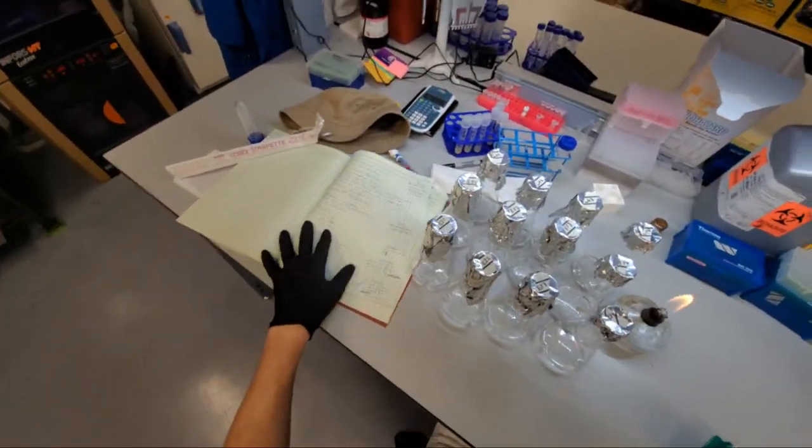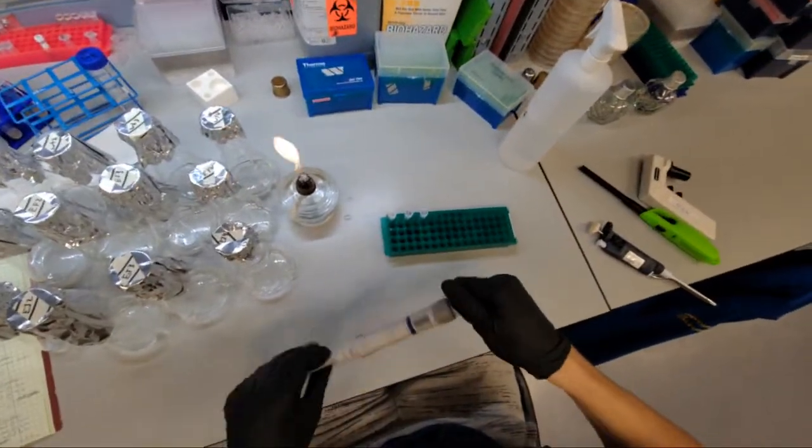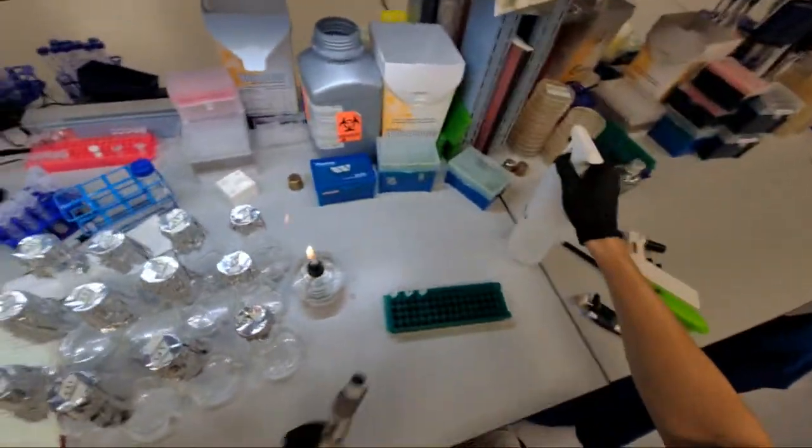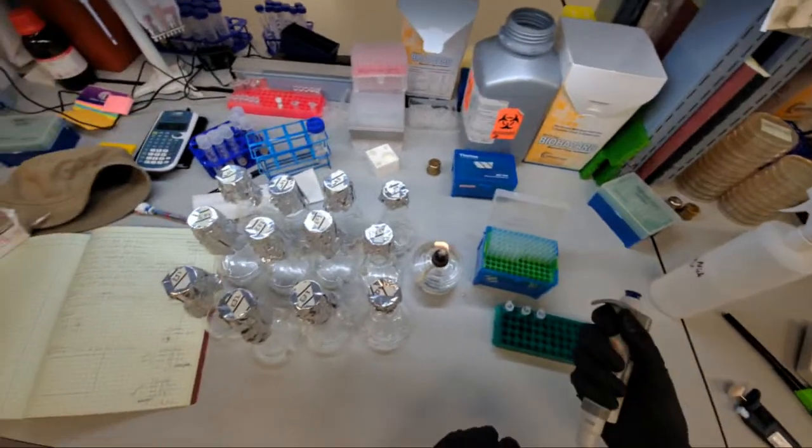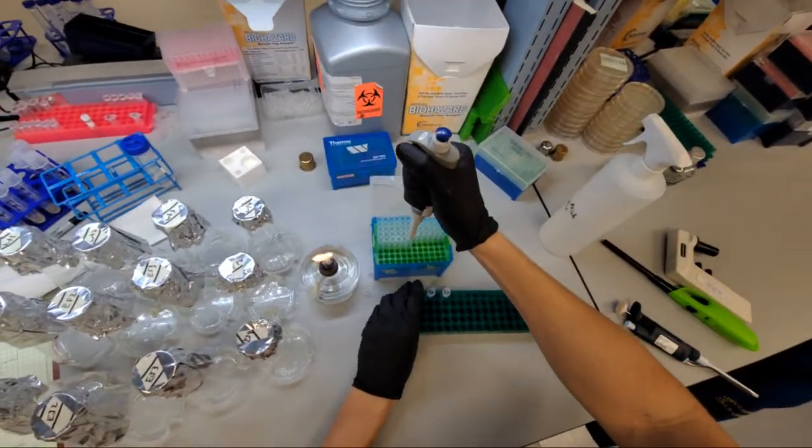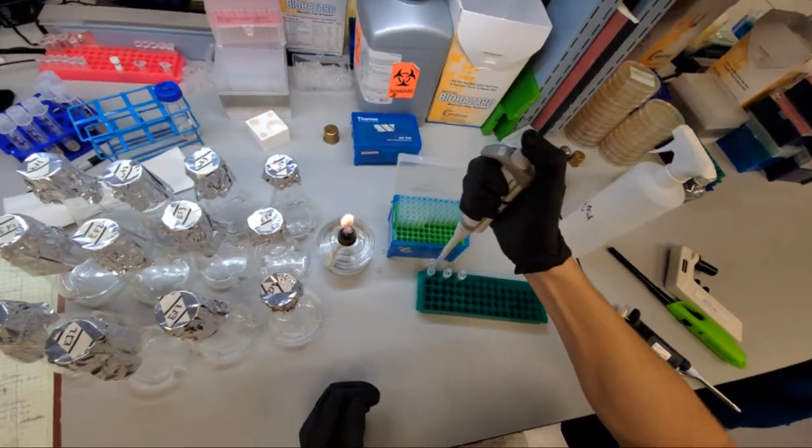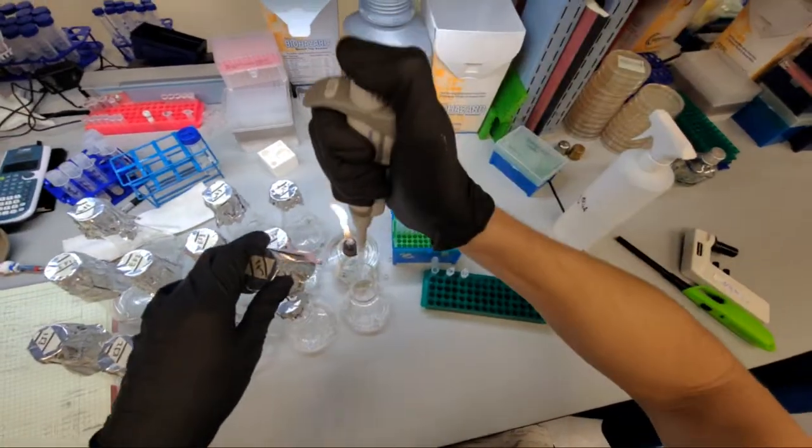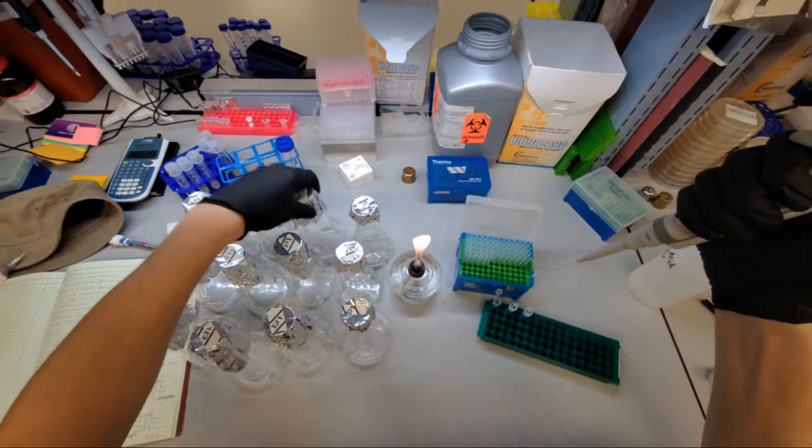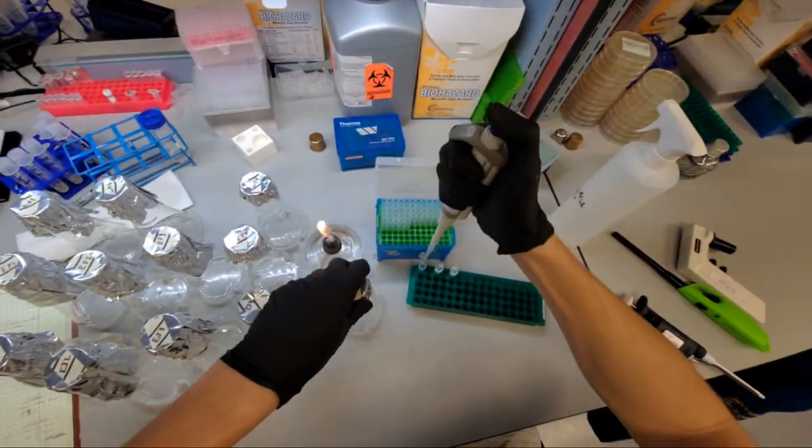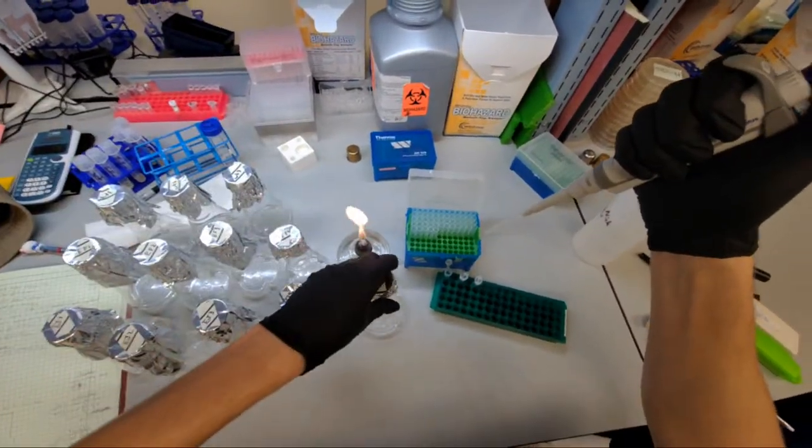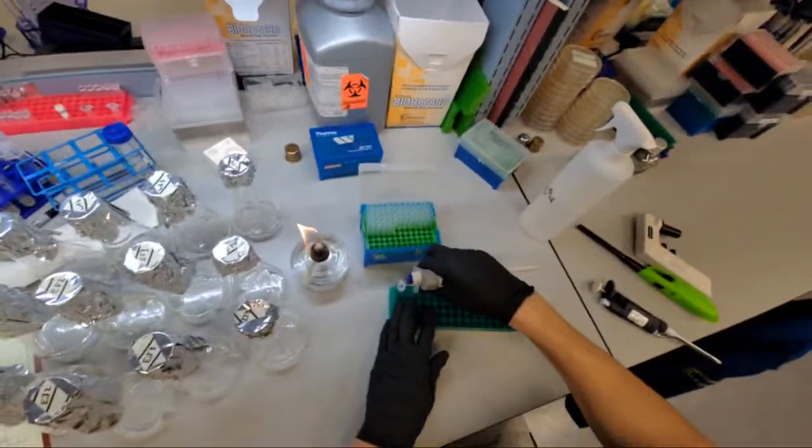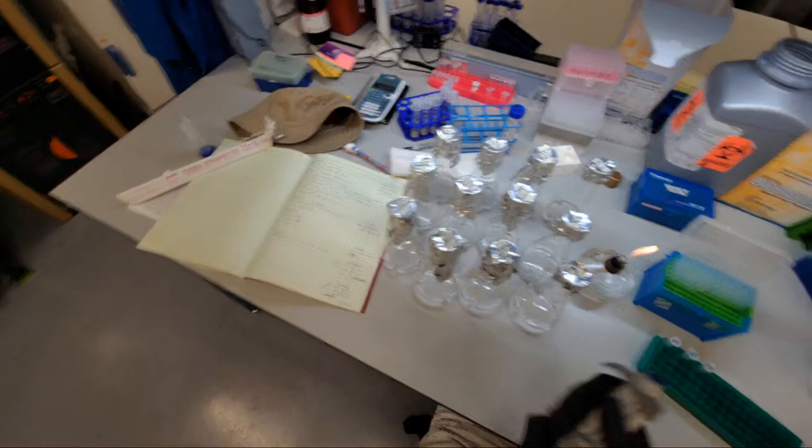So we need to inoculate each of these. So wild type we need 140 microliters so I'll set that. In between each sample I'm going to spray ethanol and I'm going to shake each tube well so that it's well mixed. Pipette that up and down once. I need to do that closer to flame. That was a little messy. Let's try to be a little more calm this time. We need 180 microliters.